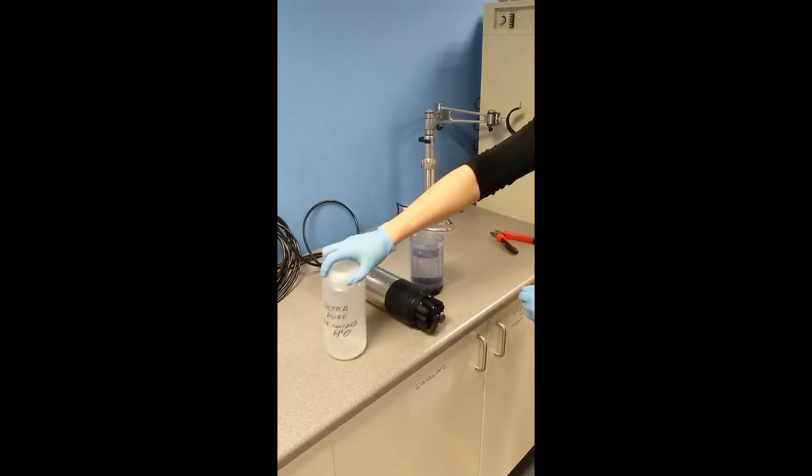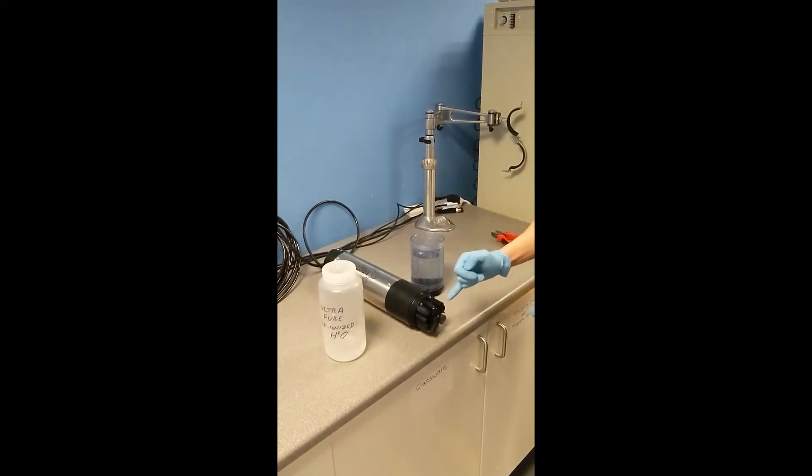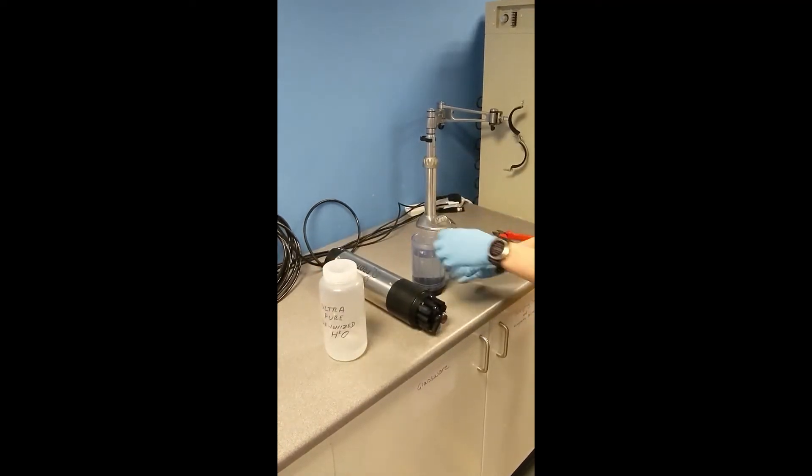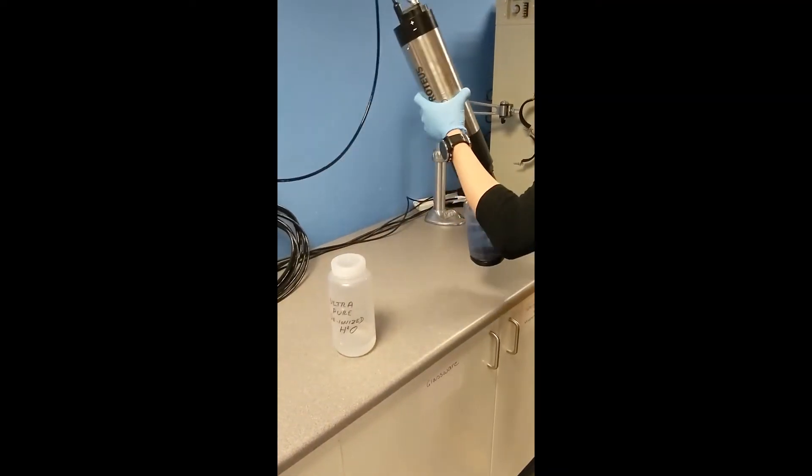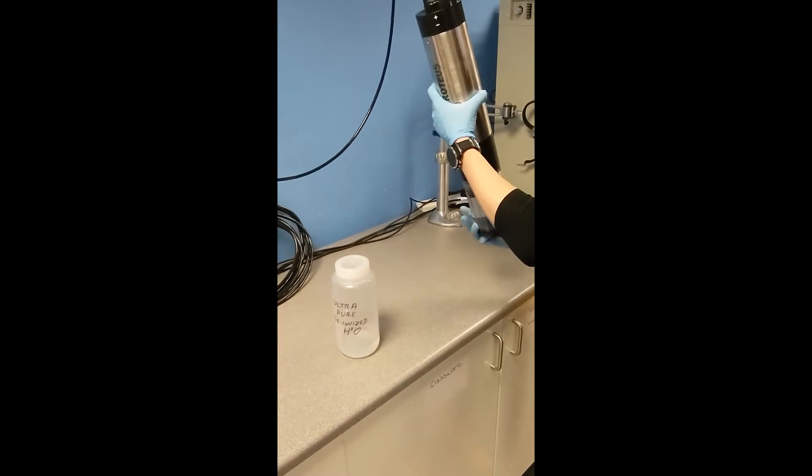You want to fill the cup up to about four centimeters below the top. It needs to cover the face of the turbidity sensor, the big one in the middle, and then we screw it back down.